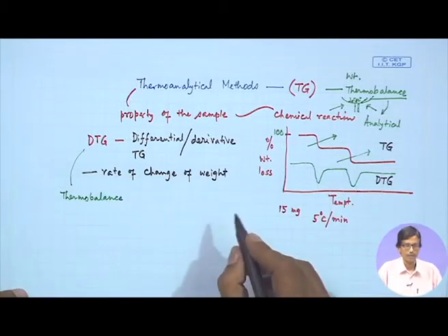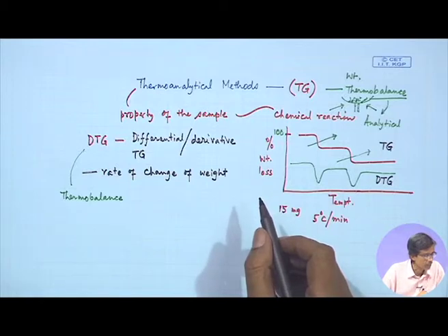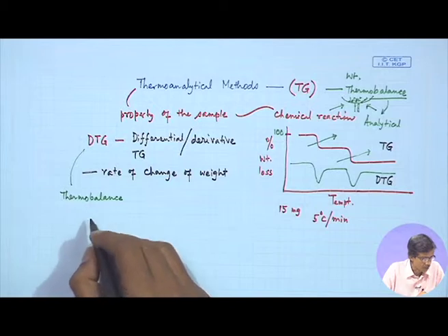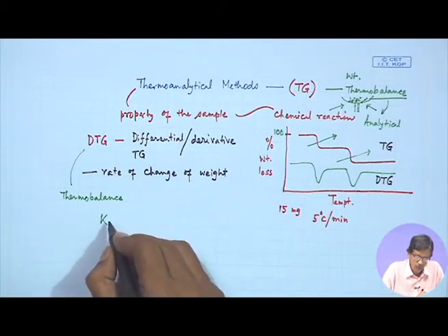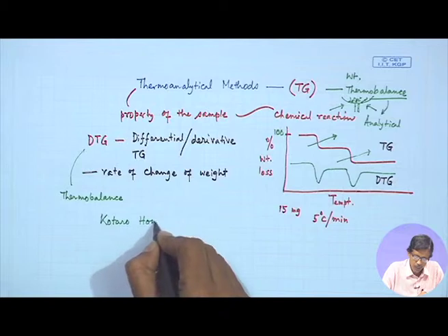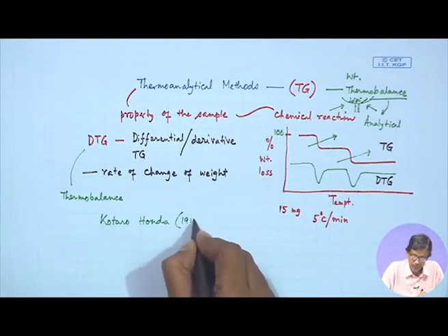How these thermobalances have been constructed, we will see, because the first thermobalance introduced for experimental purpose was by Kotaro Honda in the year 1915.